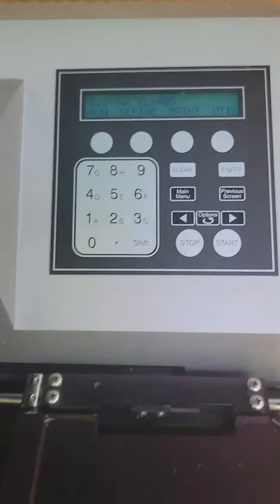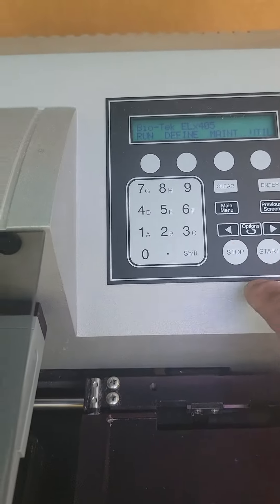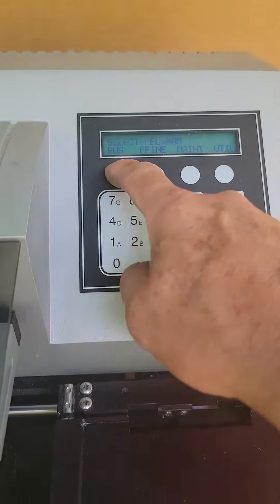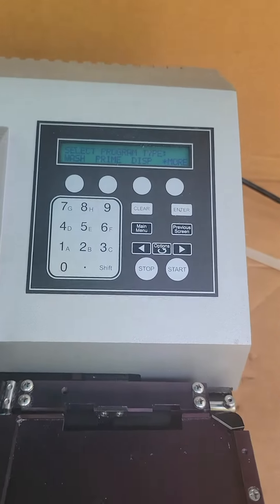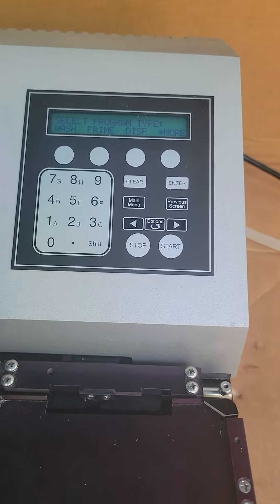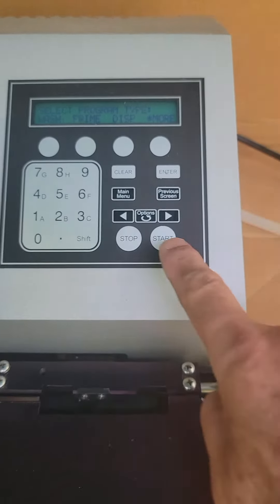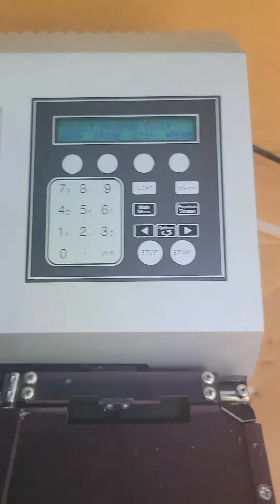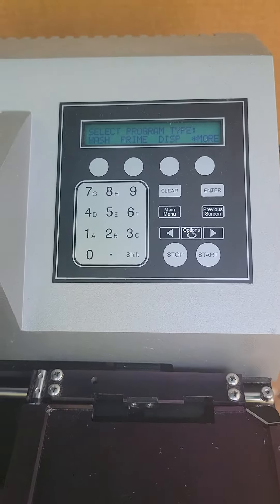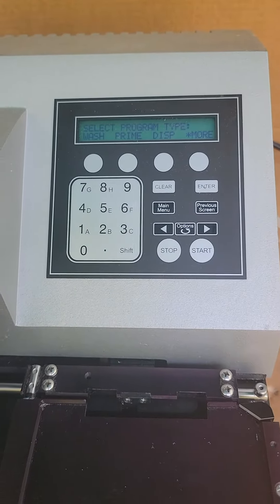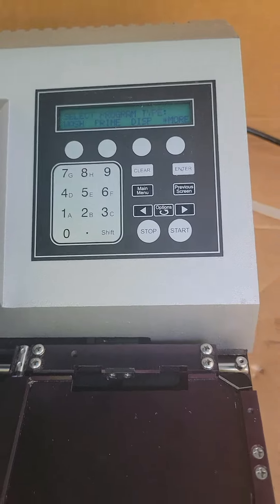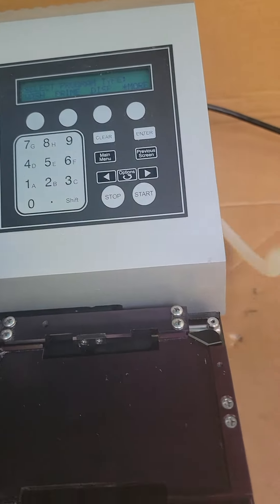And it works really nice. So if we do a run, of course it's not connected. We'll do it anyway just so you can see. Of course, we need to connect the hose to the water so it can wash.